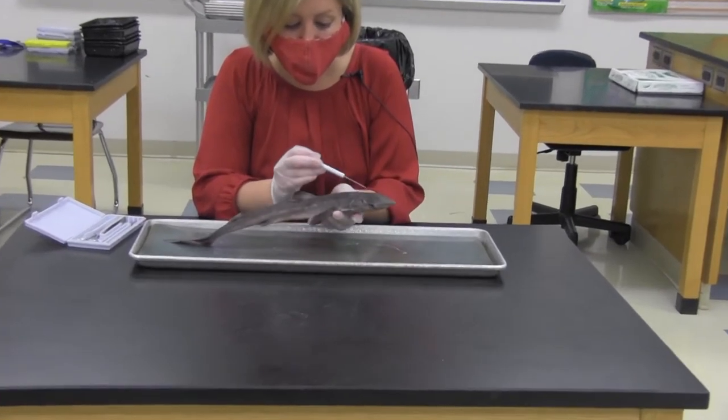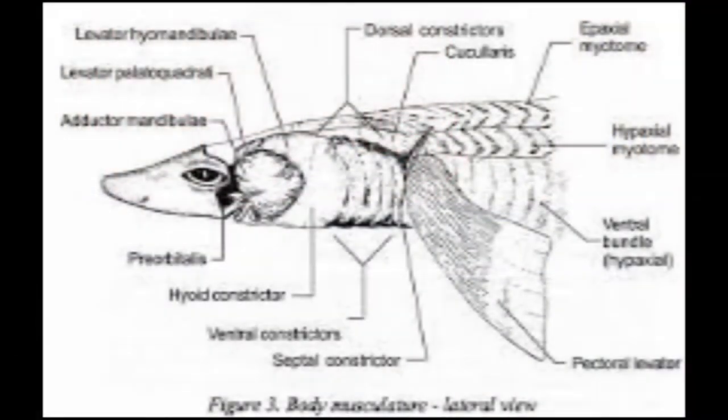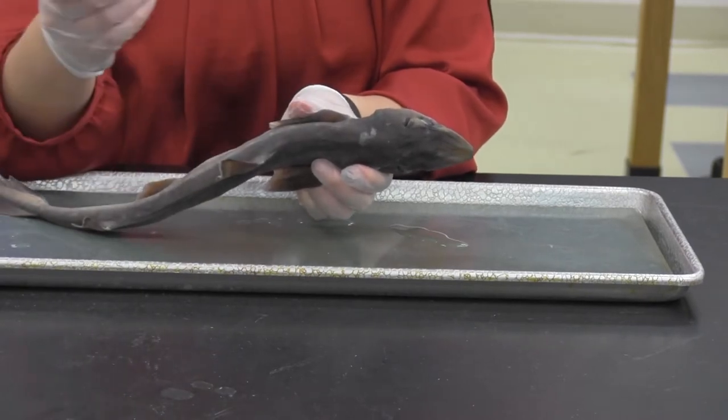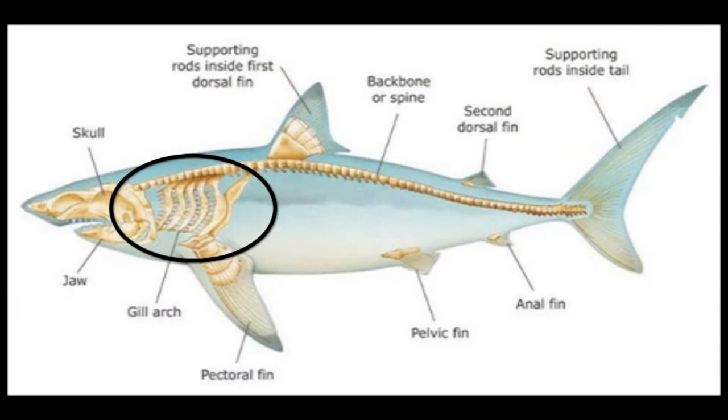Back behind the eyes we have two very specialized structures called spiracles. These are associated with the respiratory system of the dogfish. Water can enter through the spiracles when the shark is not moving, to help oxygenated water enter so that they can breathe. And then we do have our gill slits on either side — you can kind of see them here.